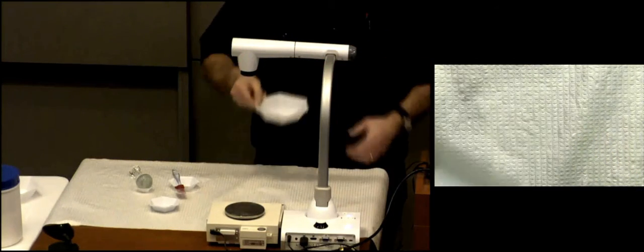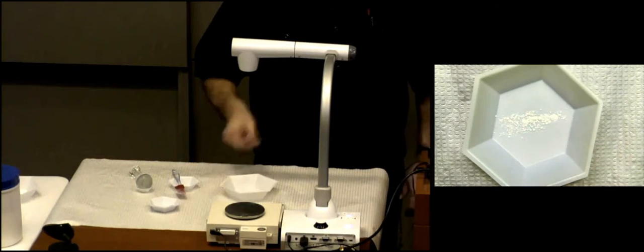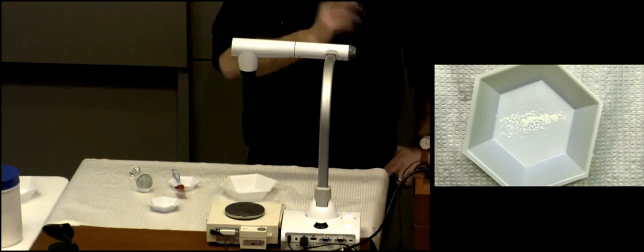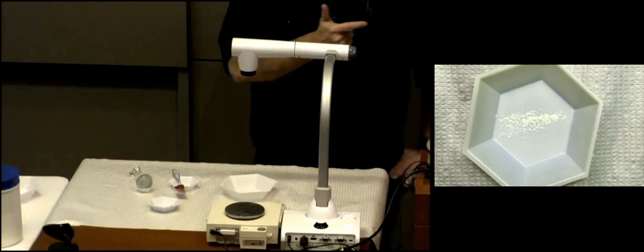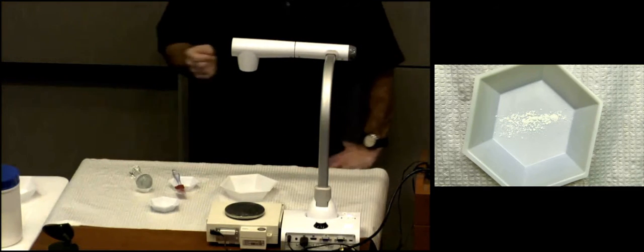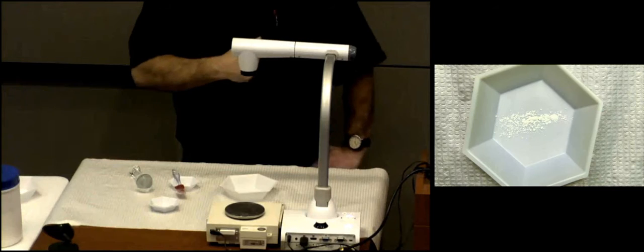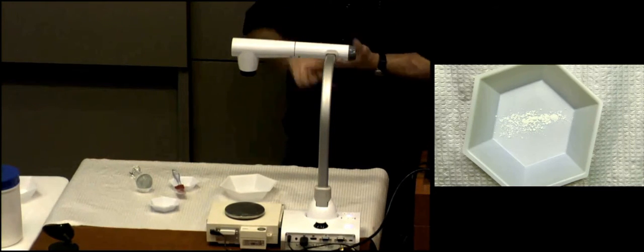Then what I need to do is this, watch. I don't smell anything. How would you describe that? Odorless. I say this because you guys realize in your wet lab that you're going to do over there, it smells. Do you know what ingredient you're using that smells all by itself? Camphor. And you're actually adding another ingredient to kind of mitigate that smell a little bit. So on your final product, you're definitely going to need to describe the odor or the scent of your product. This one, on the other hand, is odorless.